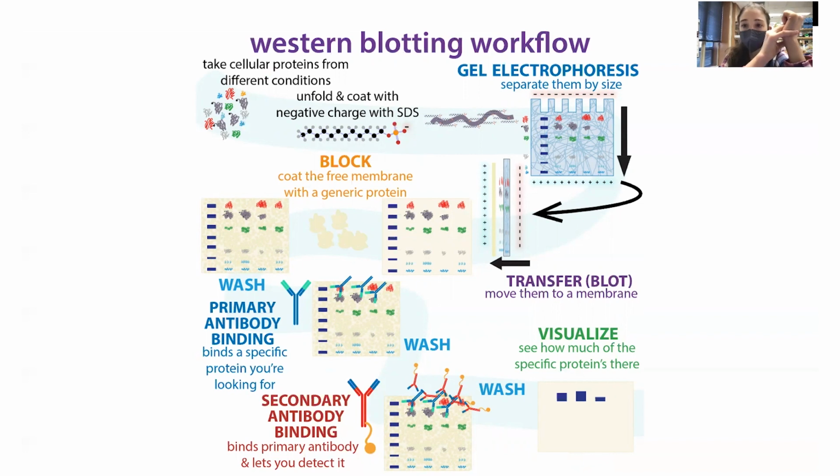So you're not getting super non-specific or really indirect interactions, depending on what you're going for, of course. But the basic idea is that the things that are bound to that protein are going to come with it. Then if you have an idea of what you think it's bound to, you can test if it's actually bound to that thing using antibodies against it. So the difference here is that we actually have to have an idea of what it's bound to.